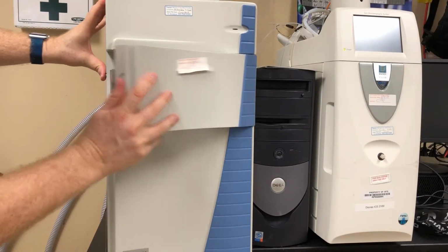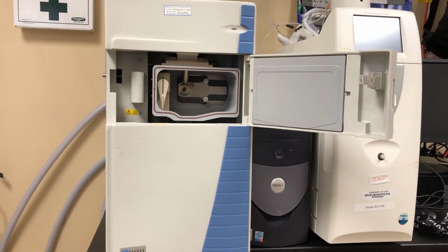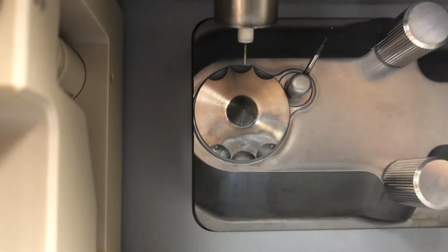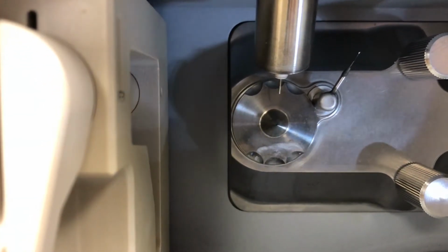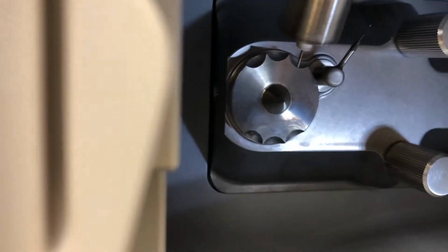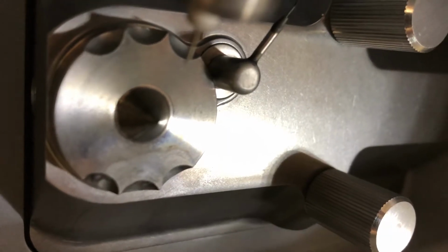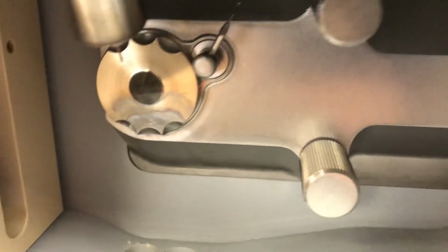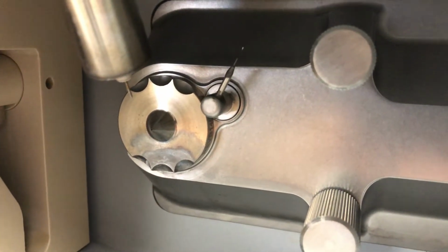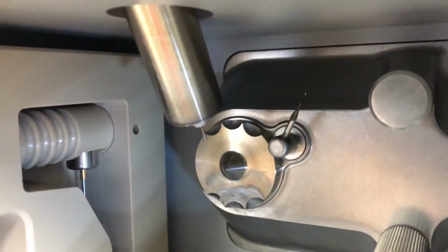Here is yet another mass spectrometer with an electrospray source. We'll open it up, and I'm showing you this one because I want to show you a cousin of electrospray called APCI. The physics are different, but usually if you have an electrospray source, you're going to have an APCI source. It's an accessory that comes with the instrument. We're doing electrospray. There's the needle, and there's the inlet to the mass spectrometer. But all we have to do is flip this lever up so that we have this needle pointing between the spray and the inlet.